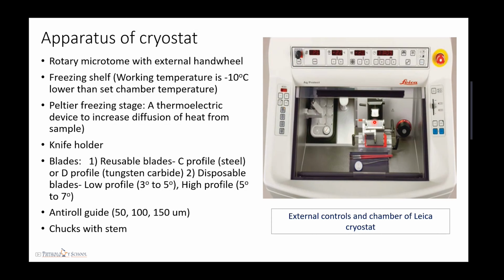Also, there is this anti-roll guide. Anti-roll guide is nothing but like there's an aluminum stage, okay, and there's a glass cover over it. So there's space between this glass cover and the aluminum stage. The space can be 50 micrometer or 100 micrometer or 150 micrometer.